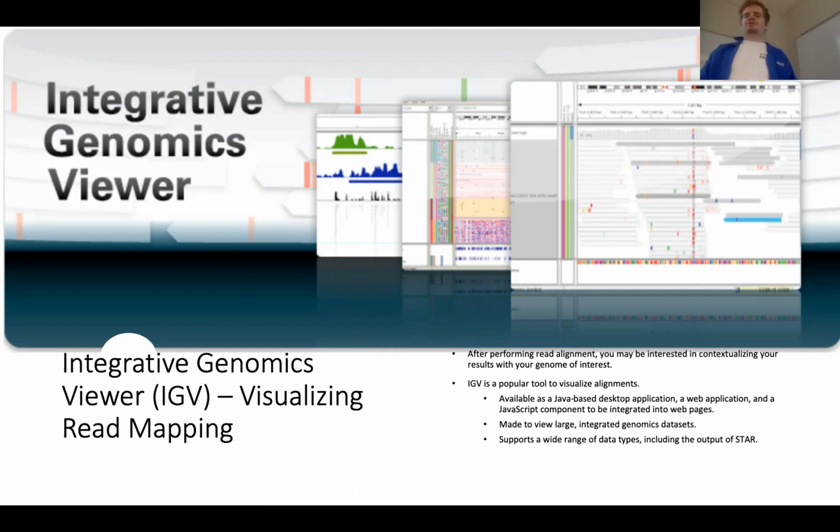IGV is a popular tool. It is available in many formats. The one we are going to use is a Java-based desktop application, which I will show you how to download. But you can also use it on the web, and you can use it integrated into web pages. Just like when we ran BLAST, one of the benefits of running BLAST on the command line was that we can use our own references.